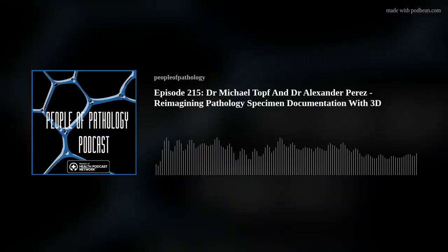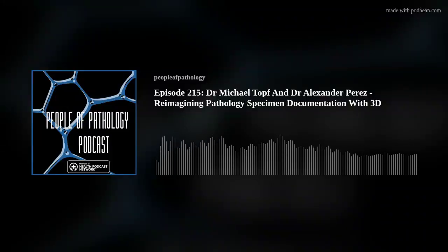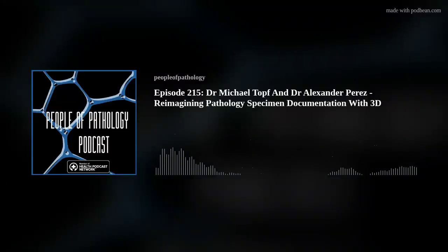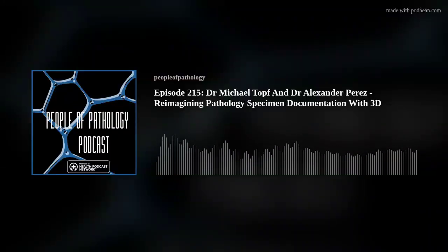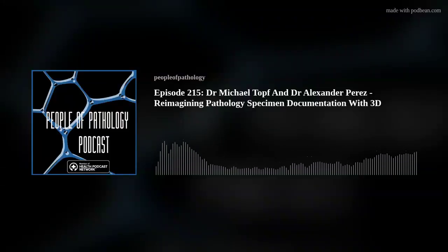And similarly, we are now working on custom software with collaborators from the Vanderbilt Institute for Surgery and Engineering. Ying Wu is a PhD collaborator that I work with in computer science, as well as Mike Miga in biomedical engineering. We're working on custom software that basically deforms the specimen back to its initial state, because we know that there is some shrinkage that occurs with the cautery and excision of the tissue, and then auto registers the specimen back into the defect.